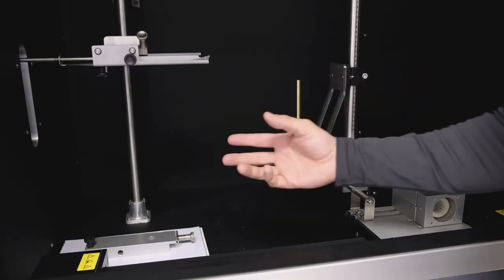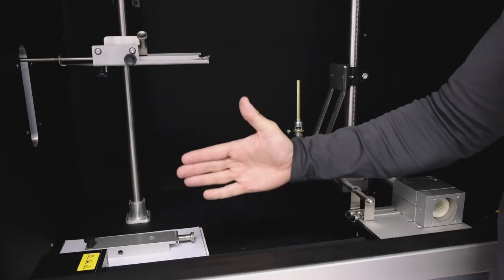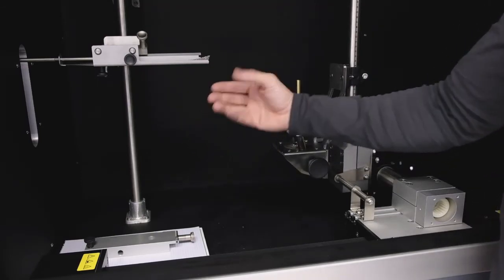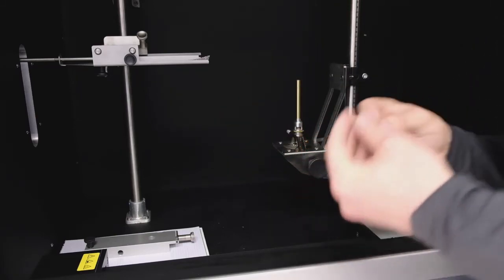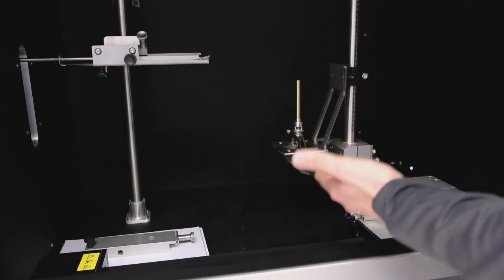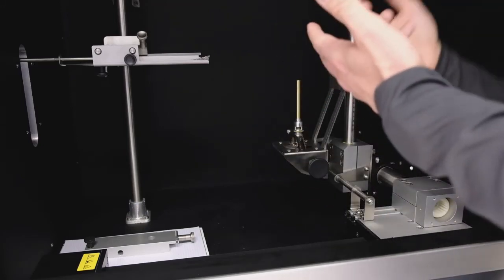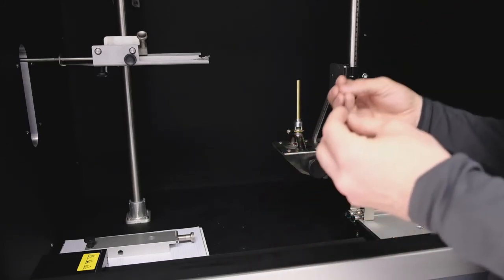You bring the burner into the initial position where you want to make your calibration, for example. Then you can ignite it in your neutral position, and after a specific time the automatic will bring the burner into the position you defined earlier for the calibration. It can collect the data during the calibration, which means it will detect when it reaches 100 degrees and after that reaching 700 degrees, and the amount of time it needs to get from temperature 1 to temperature 2 is a specific time mentioned in the standard to fulfill the criteria of the burner itself.